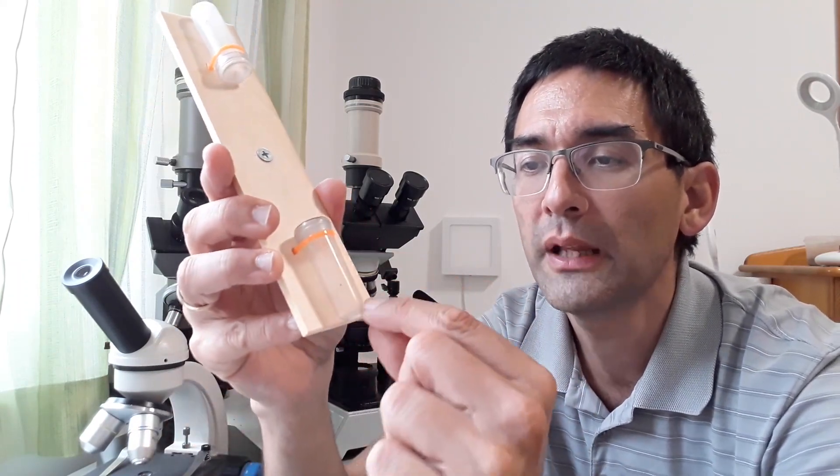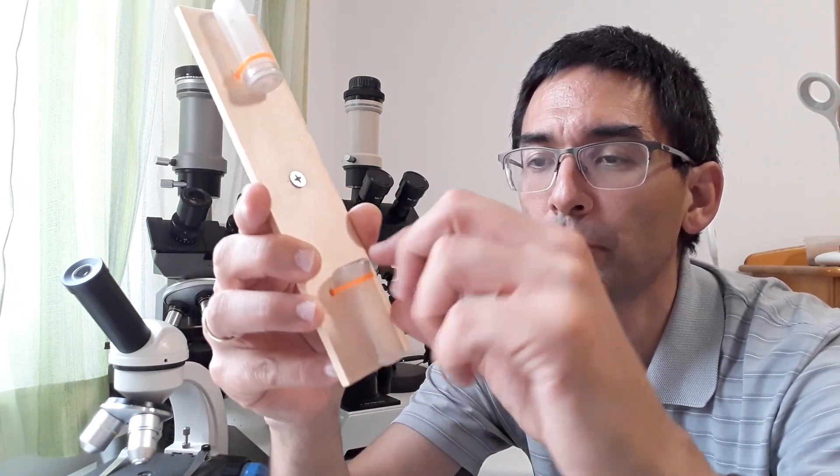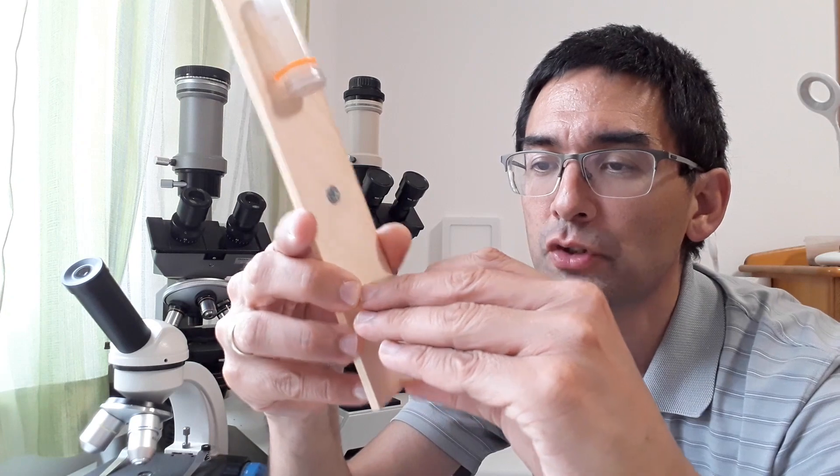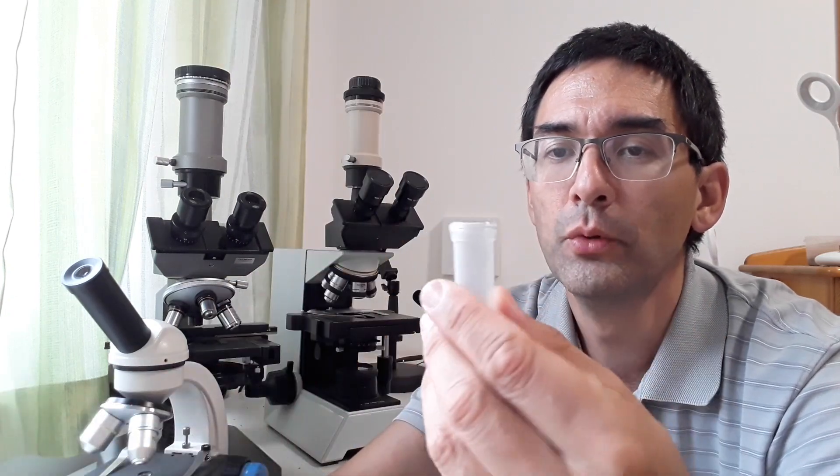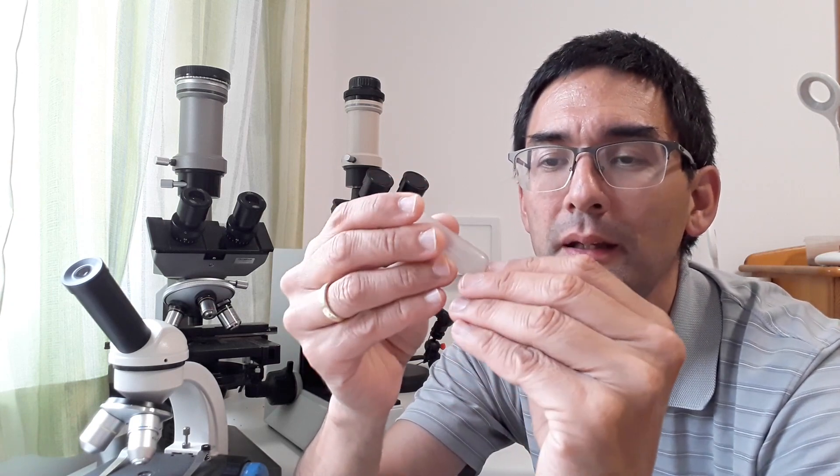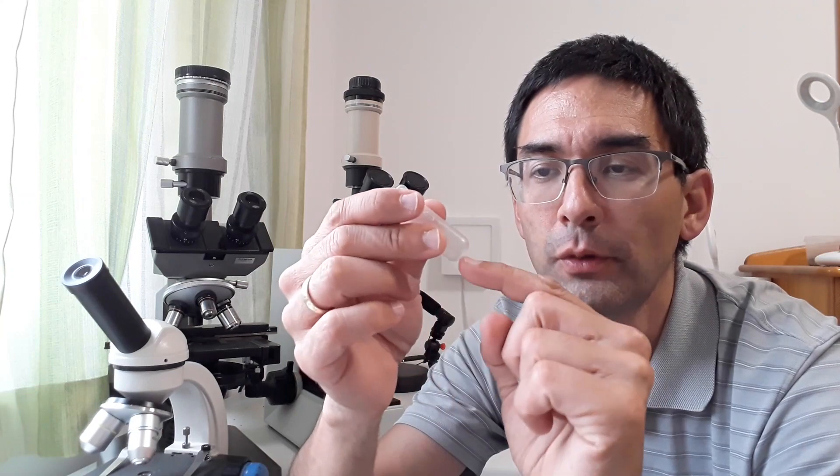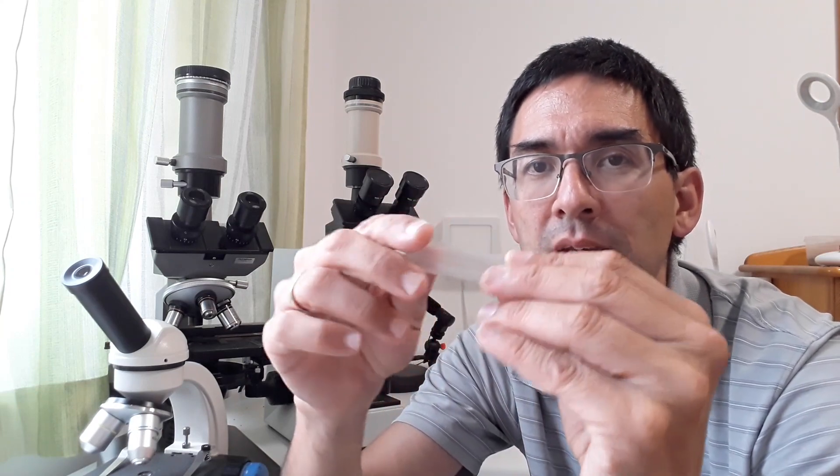All the solid particles will collect in the bottom. What you do is carefully remove the supernatant, the top water. Then on the bottom where you have the pellet, this is more concentrated and you can put something from the pellet on the microscope slide.